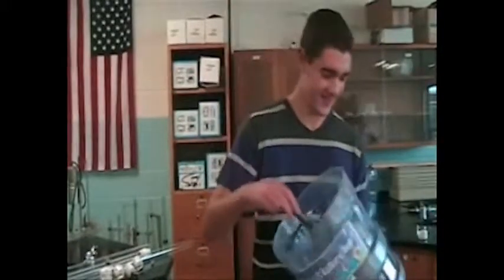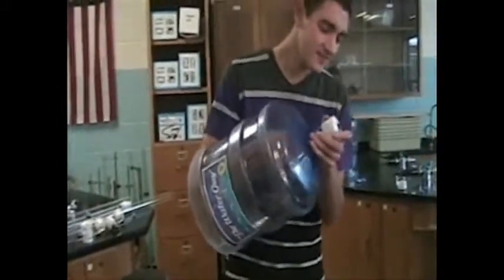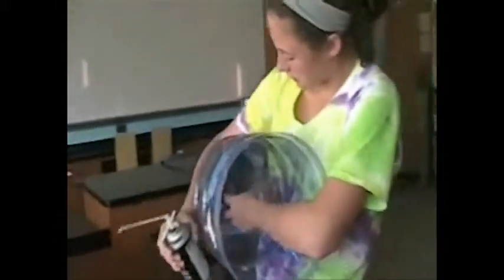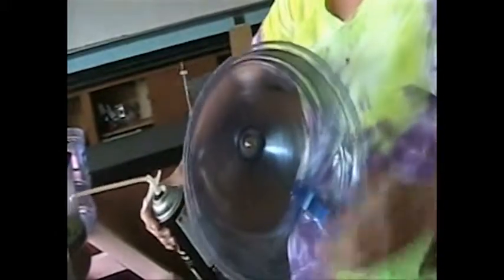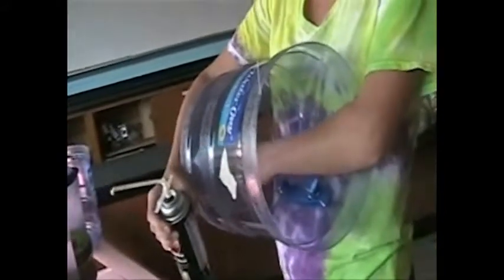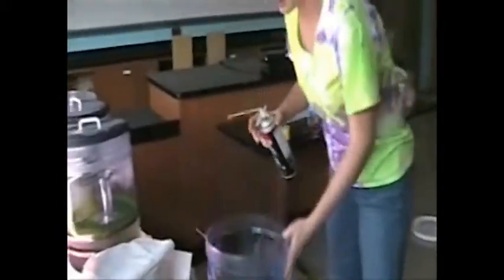Okay, now we put this into the 5-gallon bucket, which will be holding the algae. Right now I'm going to be using a spray foam insulant that we're going to spray in between the valve or the tube and the 5-gallon jug itself. The reason we're not going to use putty is because it would be too much and it won't cure properly. It'll contract and crack also. So this will help prevent that, and it'll have a faster drying process.